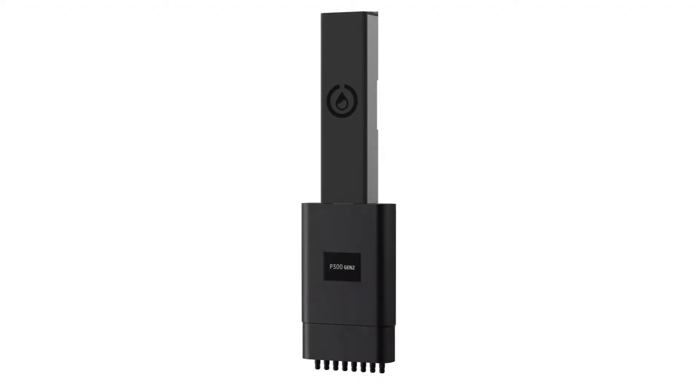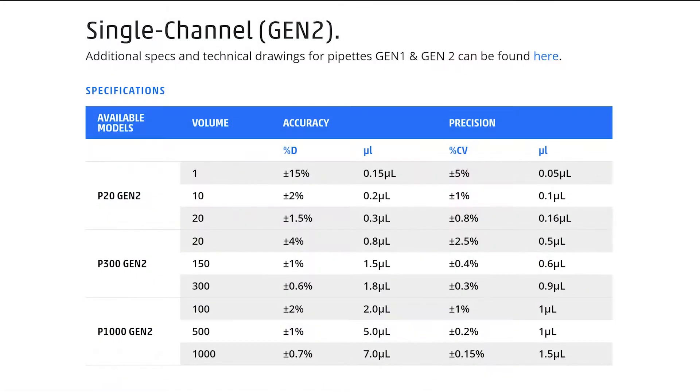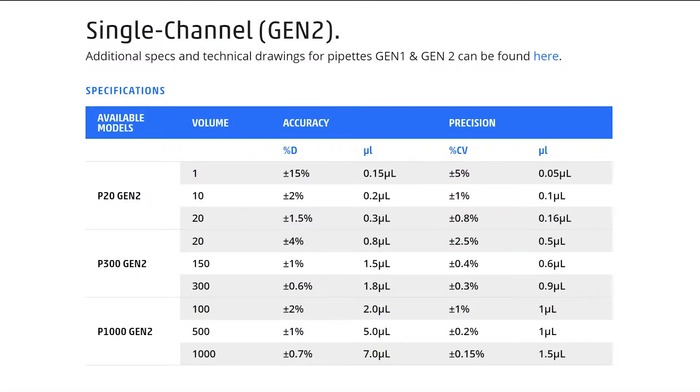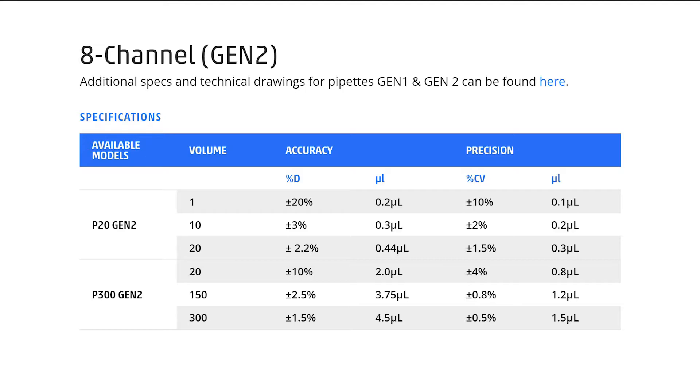We have single and eight-channel models corresponding to ranges you might be familiar with from hand pipettes. We have a P20 in both single and multi-channel, a P300 that spans a range from 20 to 300 in both single and multi-channel, and then a P1000 in the single channel for larger volume transfers.